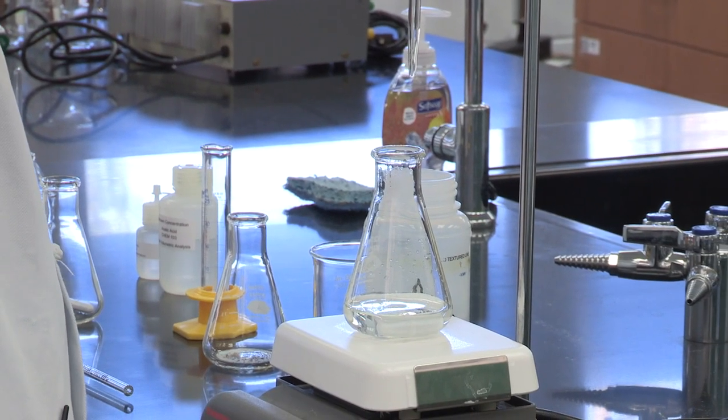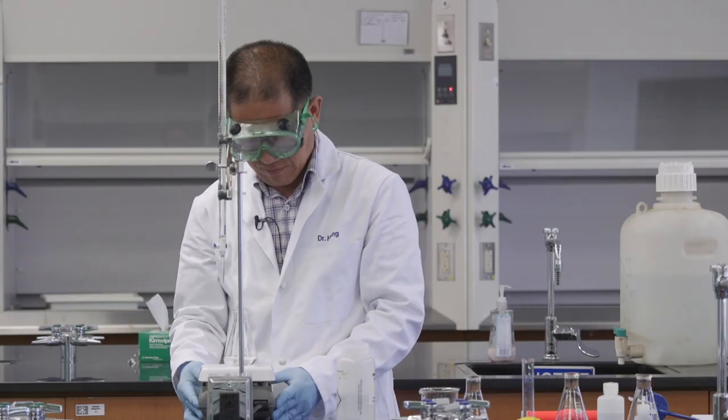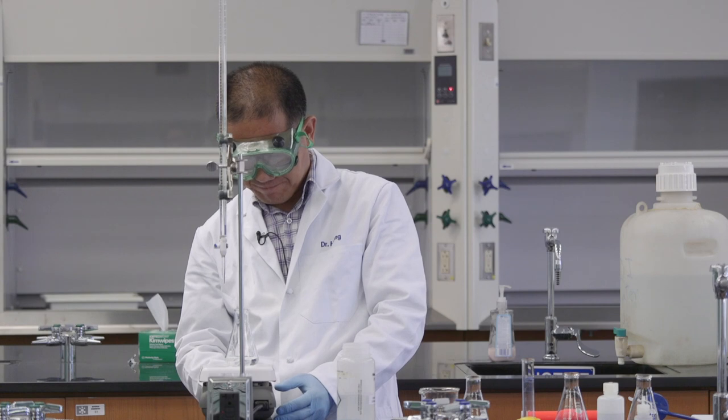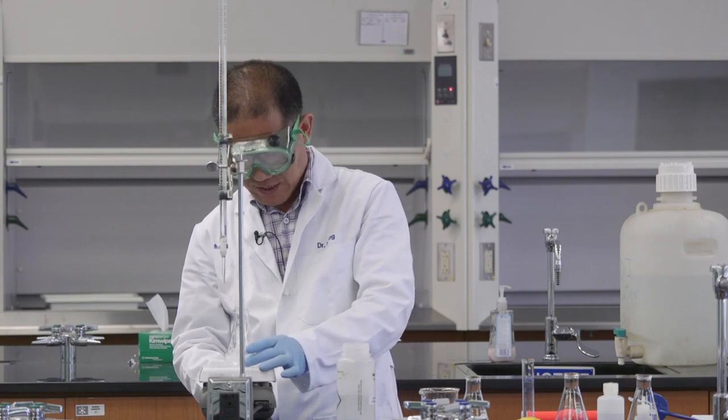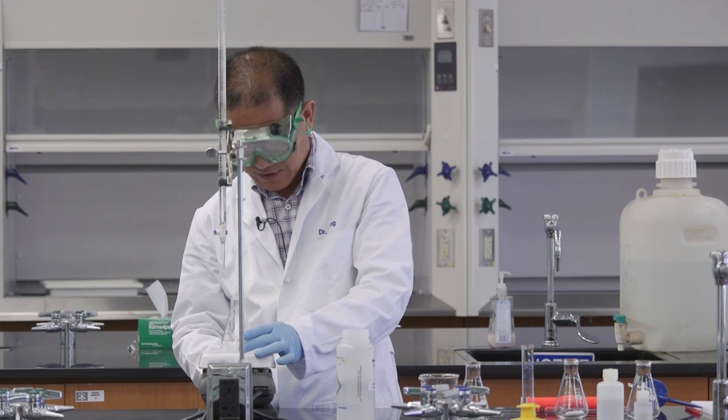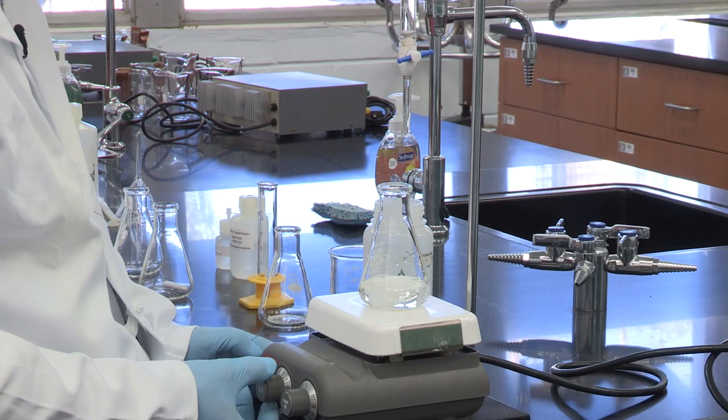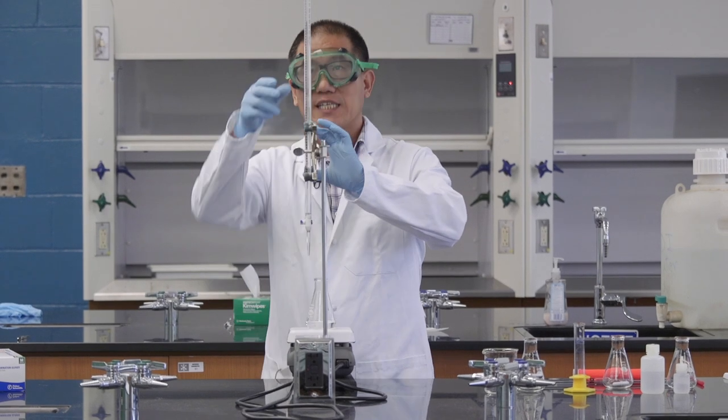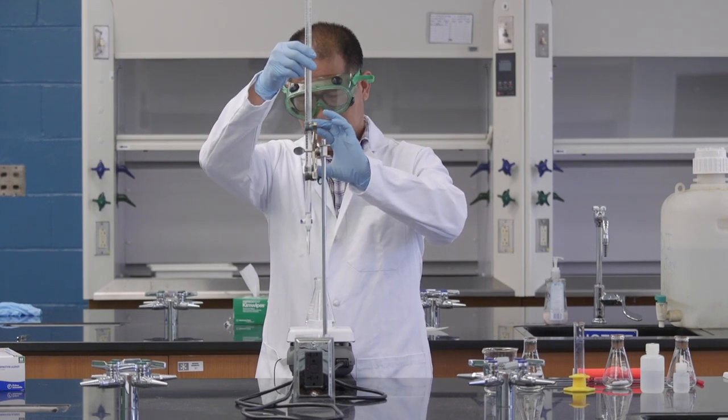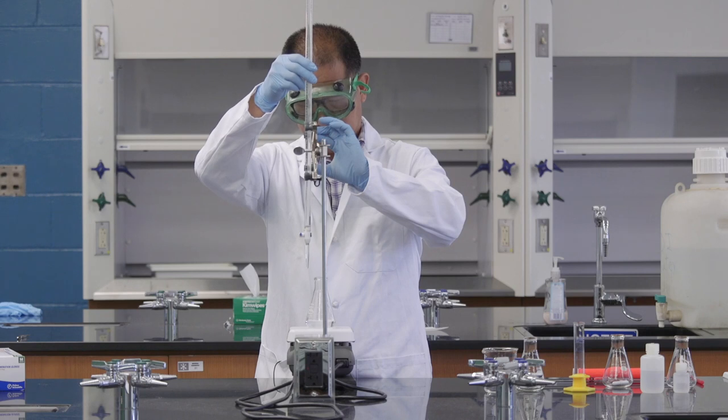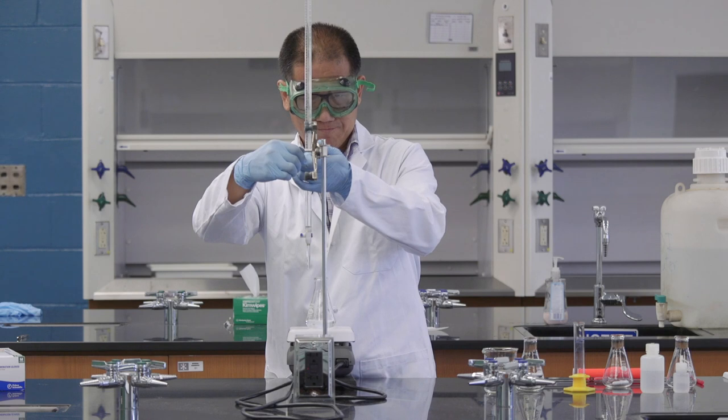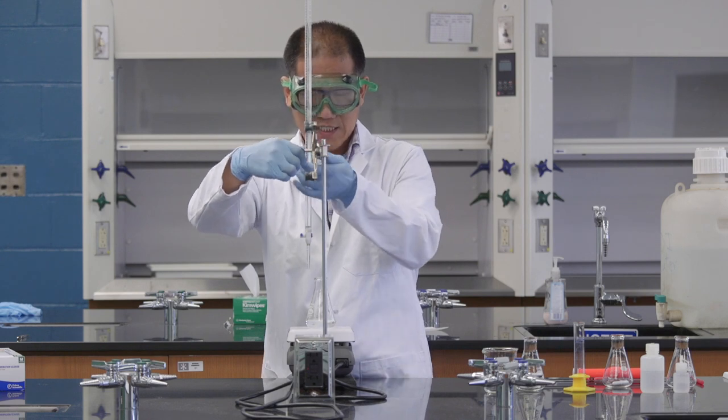Let me adjust the height of the burette, and then turn on the stir bar. Oh, okay, it's too violent, so I need to adjust the speed. Now, I'm going to adjust the height of the burette again. It seems I have adjusted the direction of this clamp.